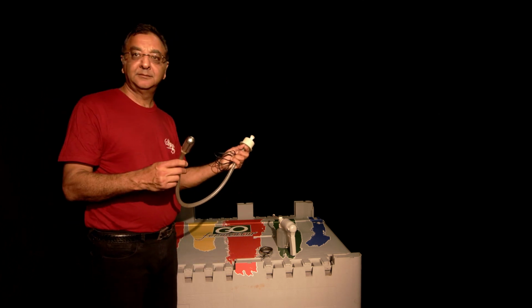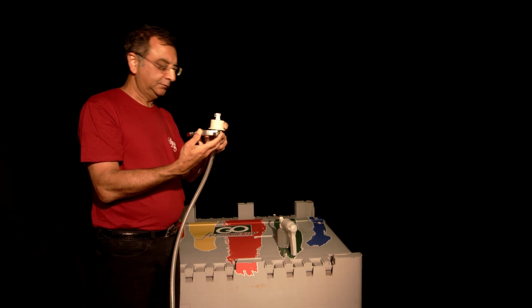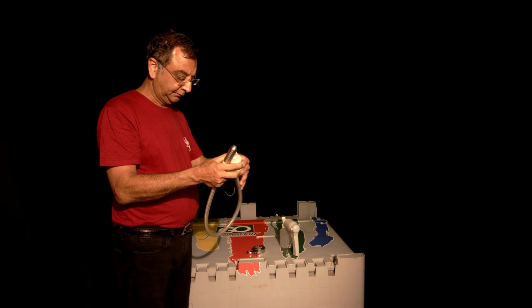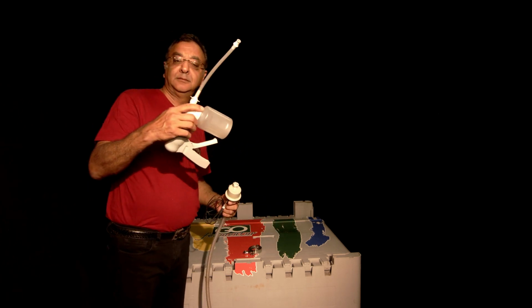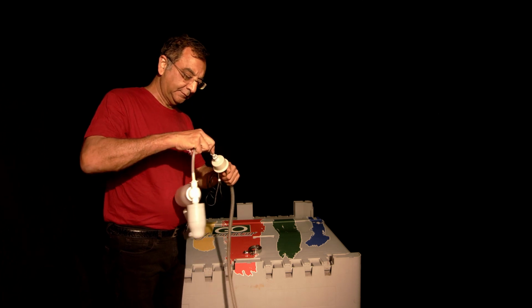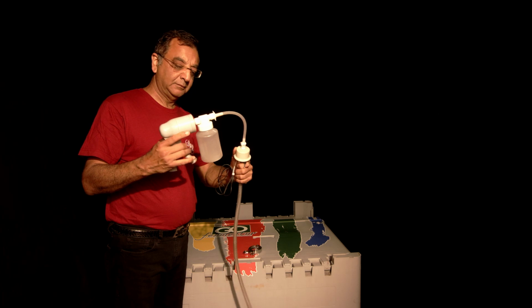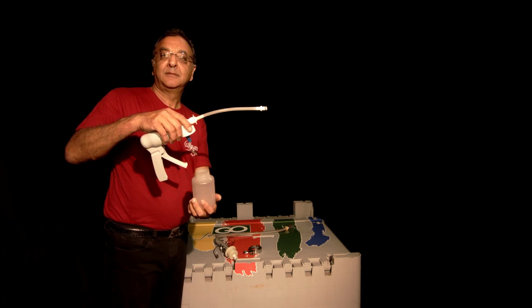Now, some of the accessories you might have: a temperature probe sampler kit that goes into the bag, hangs on with a clamp. The temperature probe is inside that stainless piece and the plug is on that end. That is the sampling port. You have a handheld sampler, you plug it in, it opens the channel, you give it a couple of squeezes, it pulls the sample up.